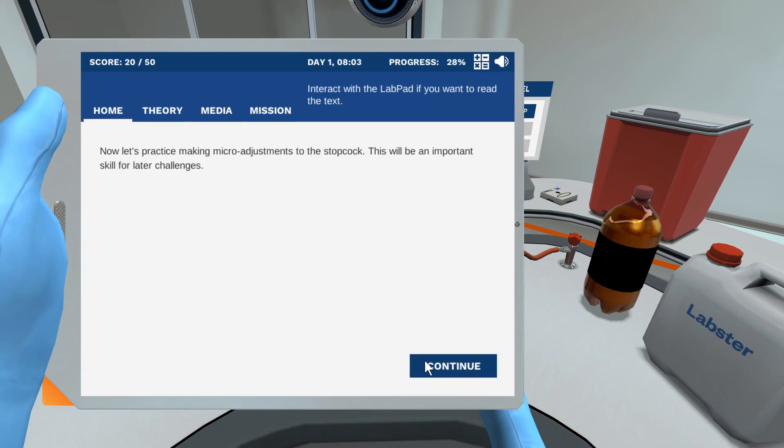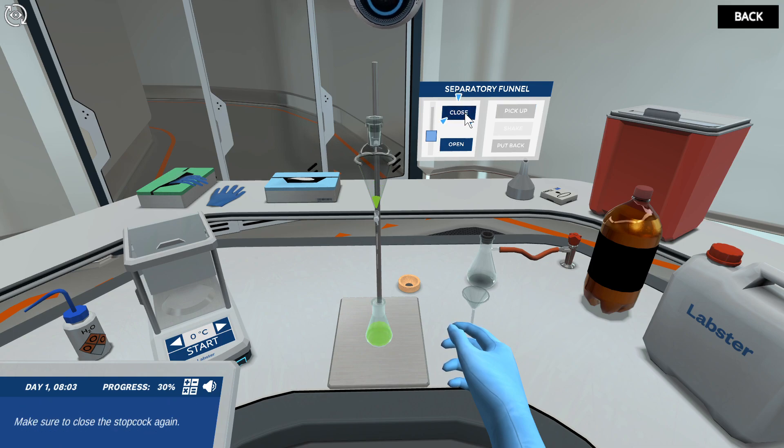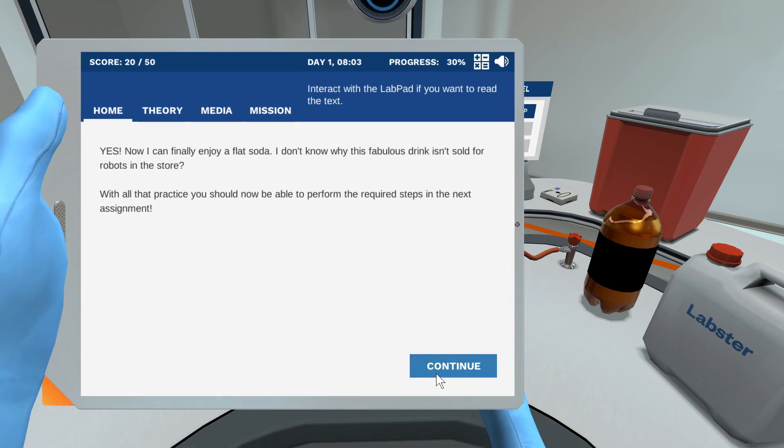Now let's practice making micro adjustments. Carefully open the stopcock using the slider on the screen. Make sure to close the stopcock again. Now I can finally enjoy it.